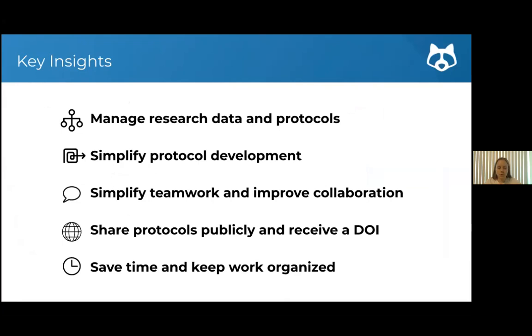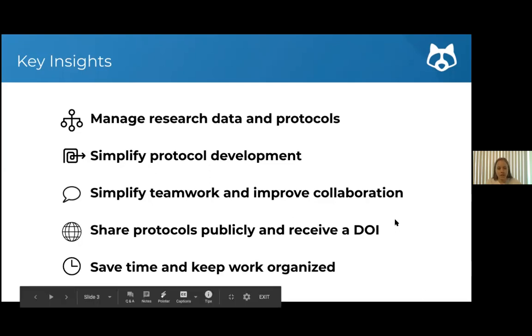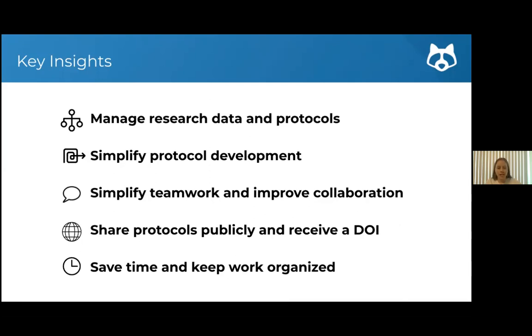If you do use protocols.io very early on in your research, it can really also simplify your protocol development. So you don't have to have a ready protocol to use the platform. You can even start using it while you're still developing your protocol. Also, we have a lot of features that allow you to simplify teamwork and improve collaboration.